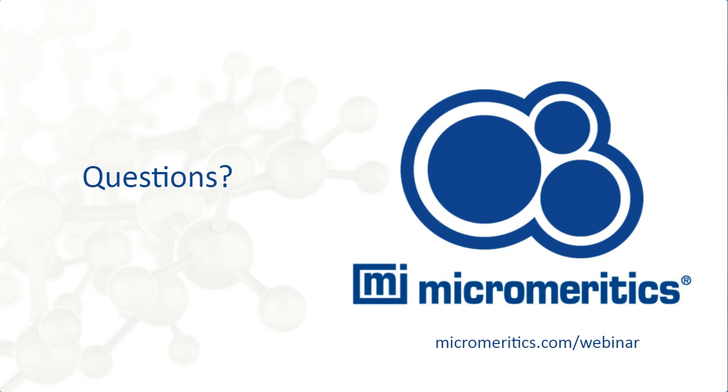Okay, yeah, great, thank you. Just moving on then through our questions, a much more practical one here. Is there a particle size limit to running the caking test? And the person in question here has mentioned they have granular material that's around 500 microns.